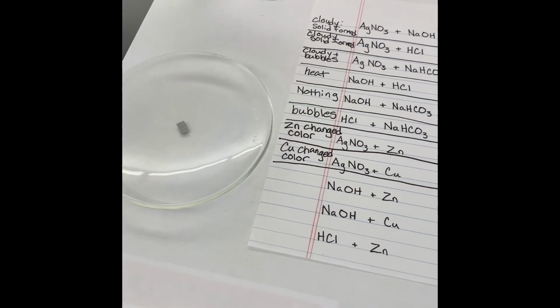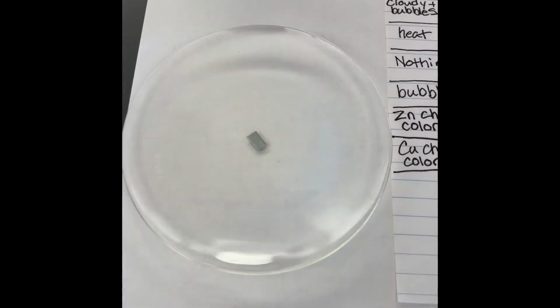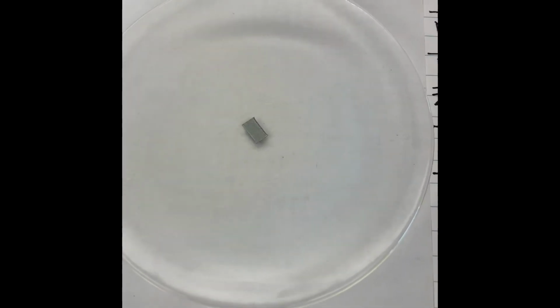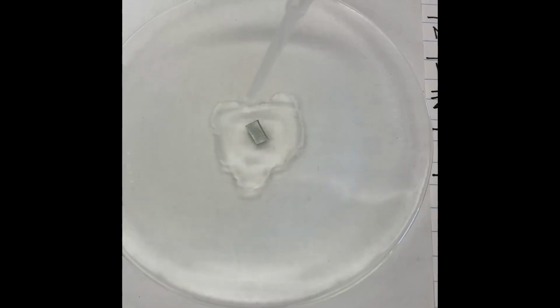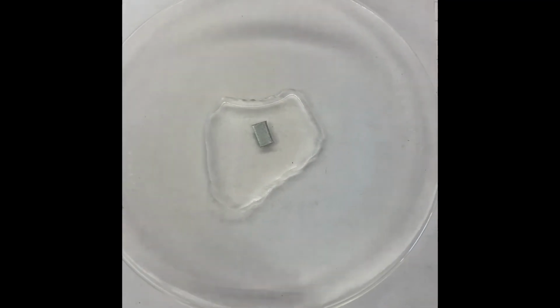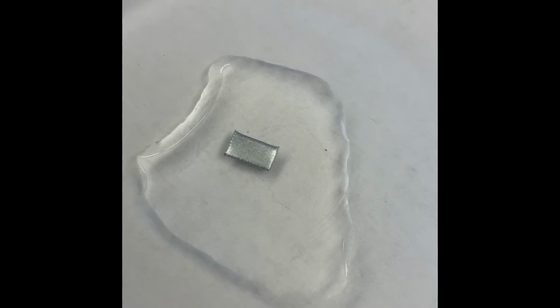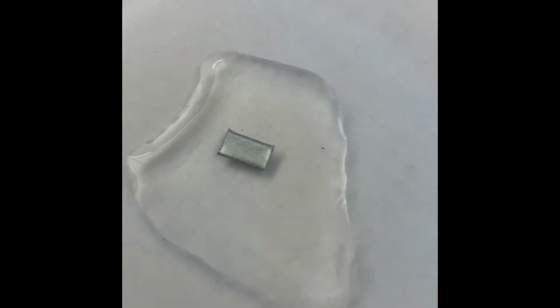Here we have the sodium hydroxide and the zinc foil. There we go.